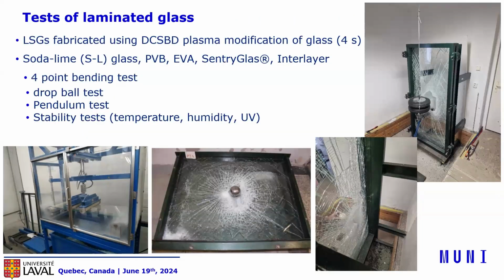Maybe I would like to say that I present some results, but in fact all the applications and research I was talking about also have their own background and scientific study. So we are investigating not only such simpler or standard tests, but also studying the processes responsible for the treatment using XPS and atomic force microscopy. But these are standard tests which are used in the industry of laminated safety glasses.